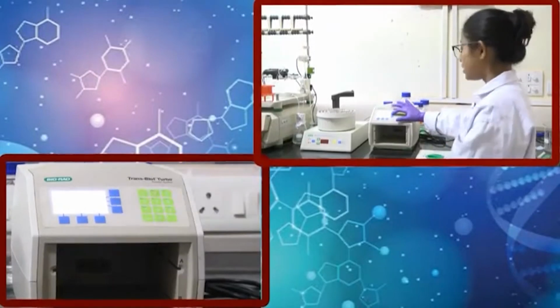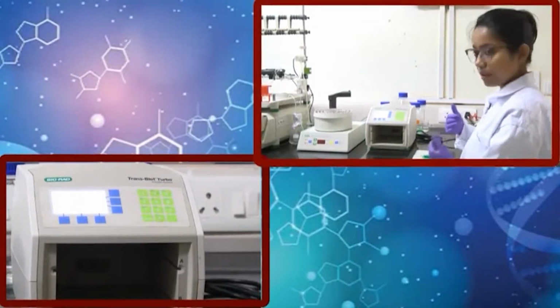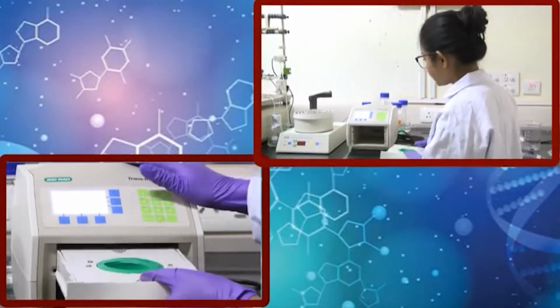So, this time and the voltage basically you need to check depending on your protein. I know that in 15 minutes at 20 volt my proteins will all come out from the gel and get to the membrane. But if you see, after you see the gel membrane, that not all the proteins are getting transferred, or if your protein is quite big, then you go for more time.